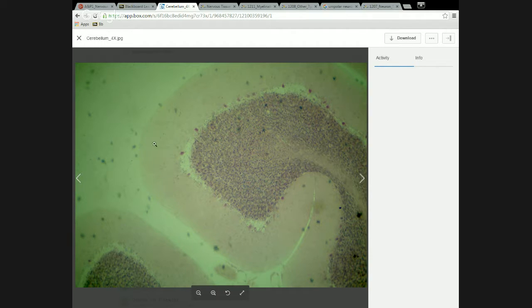And this is tissue. We can see the edge of the tissue kind of folding in here and folding in a little deeper here, and then the fold comes out. So when we see one of those wrinkles on the surface of the cerebellum, what we're looking at is this crevice right here, basically. So the wrinkles make a very convoluted outline or surface of the cerebellum, and that surface looks like what we have here.